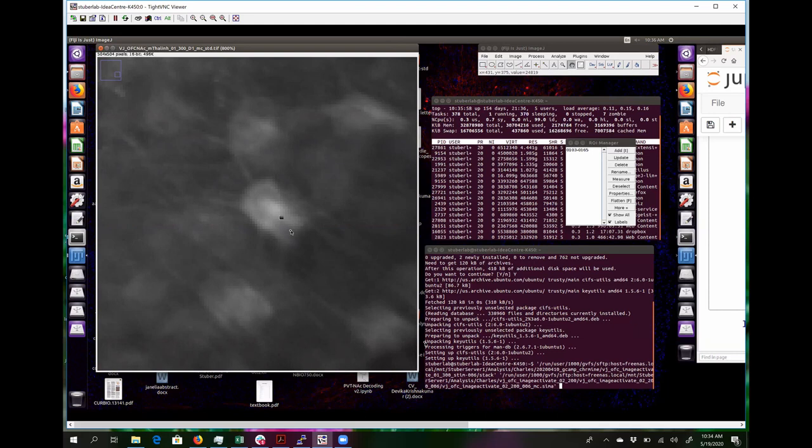I personally don't agree with it, because I think that's still usable data. Of course, it's not going to be as perfect as near the center, but if the purpose of this is to actually extract meaningful signals from the cells, I think you should still use the same sort of criteria to get meaningful signals from these cells. You just have to be a bit more stringent.